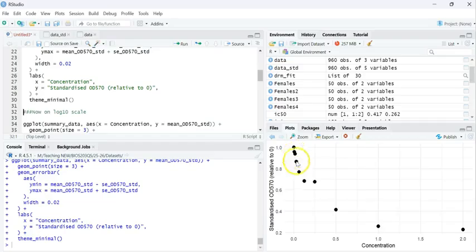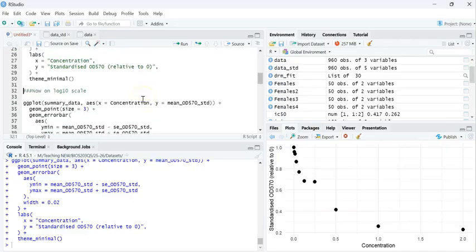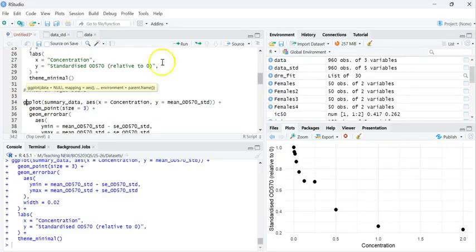Okay, so you can see that this is quite non-linear. We've not been dealing with non-linear regression, so this is why we've done these videos for you. But we now want to plot it on a log 10 scale. So if your data is not linear, one of the ways that we can make it become linear is by transforming the data using log 10, or we can proceed with a non-linear regression.